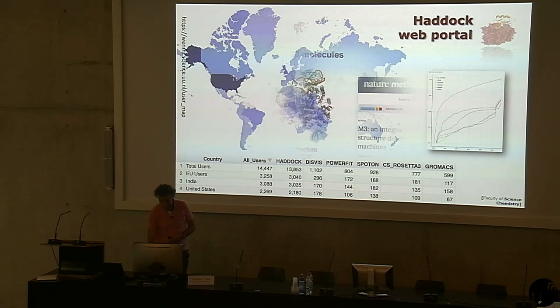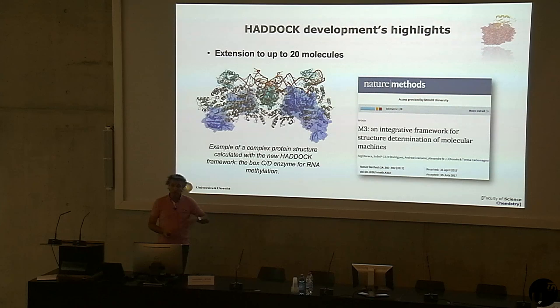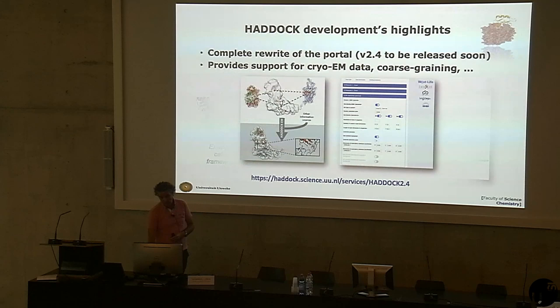Some recent developments, some highlights. I already mentioned that we can now go up to 20 molecules. The portal you just saw is handling a maximum of 6 molecules. The new version, which you're going to use this afternoon in a tutorial, can go up to 20 and can also support cryo-electron microscopy data. If you have high resolution data in cryo-EM, you don't need to do docking. You can build your model straight into the maps. But there will be cases where the resolution is still limited, where you might need to go to a docking approach. So now we can handle this kind of data as well.